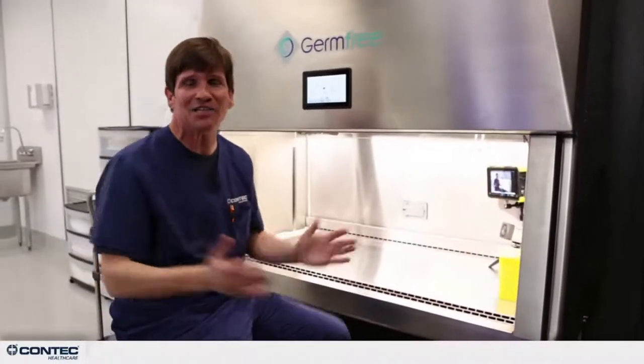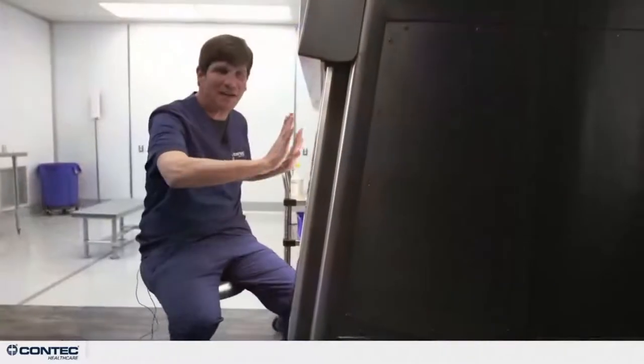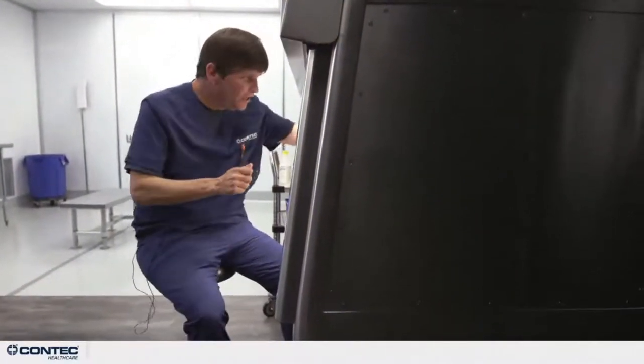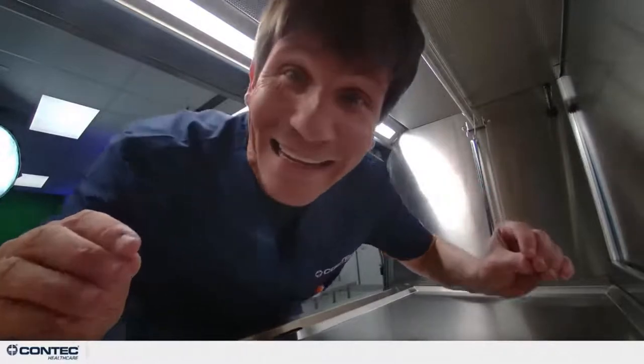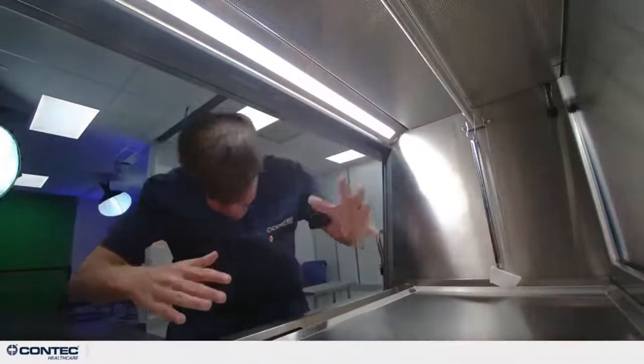That gas station cleaning tool was better than the alternative of breaking the plane. So right here we have the plane of this device, and we're going to be using our hand to go in and clean that, but it's never appropriate for us to put our body inside of this. Let me say that again. It's never appropriate for you to lean your body inside, especially this is a CPEC.